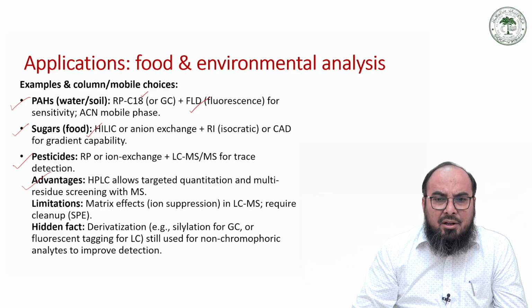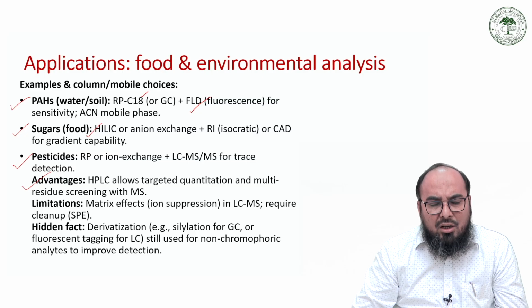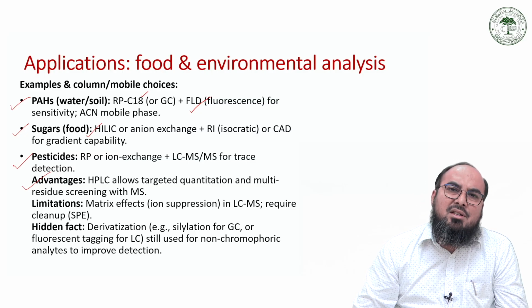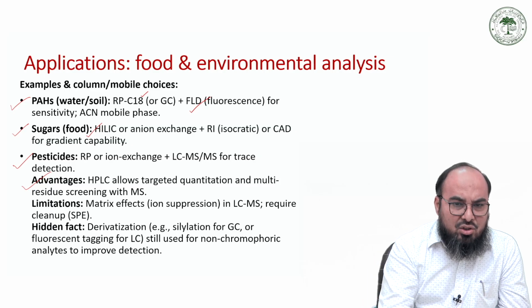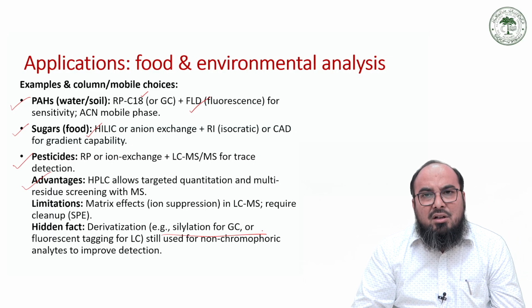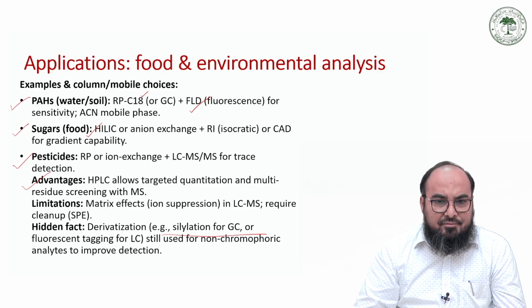For example, you have to carry out regular cleaning of your column and detectors, so that no unwanted or previously held samples are there. Similarly, for silylation for GC, you have to check for some groups that may lead to clogging.